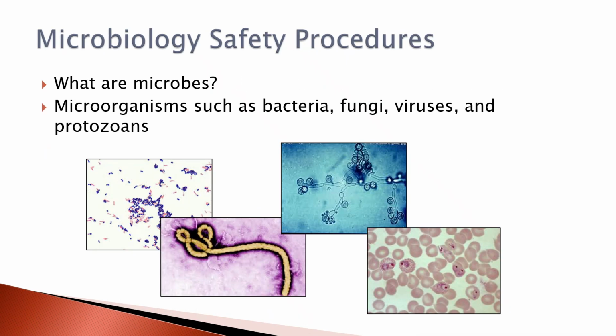Some safety procedures we want to know. What are microbes? That's what we're talking about this whole semester. So we're talking about bacteria, fungi, viruses, and protozoa. In our teaching labs, we deal primarily with bacteria, but in other labs that you may come in line with, they would maybe deal with some of these other microorganisms.